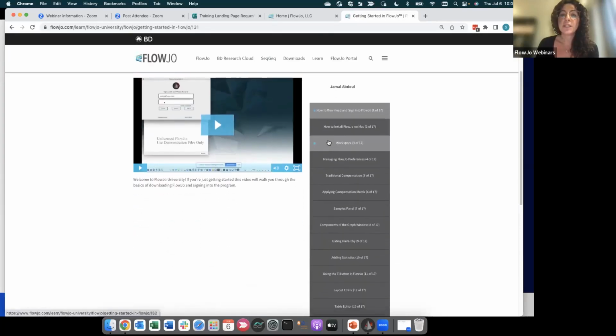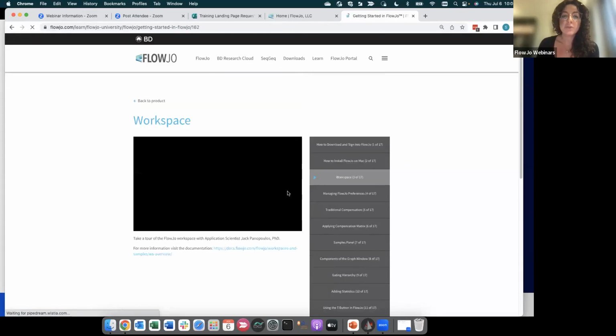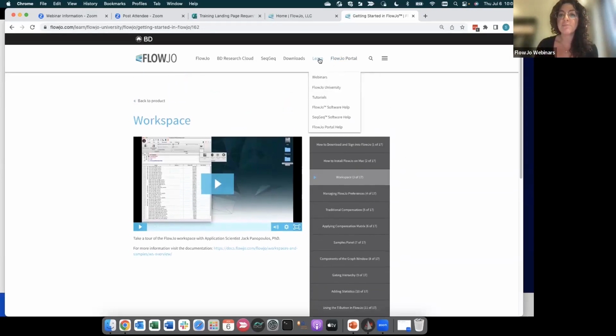Whenever you click onto these areas, you will find on the right all the different videos by title. If you click on any of them, you will see that there are small videos. These are 5 to 10 minute videos, so they are easy to check. And in case you don't remember something, you will find it within the FlowJo University.